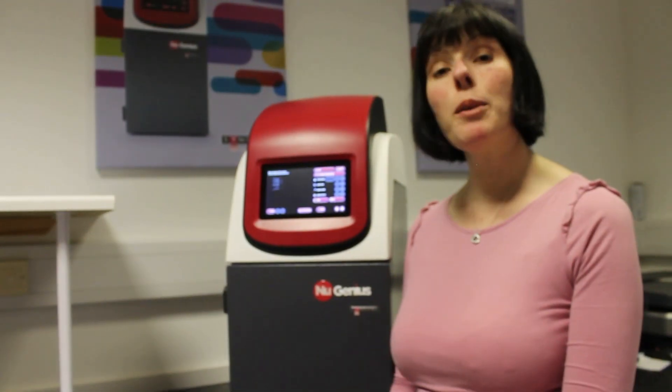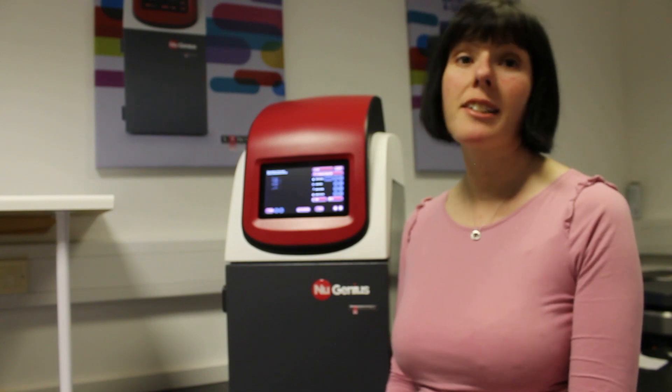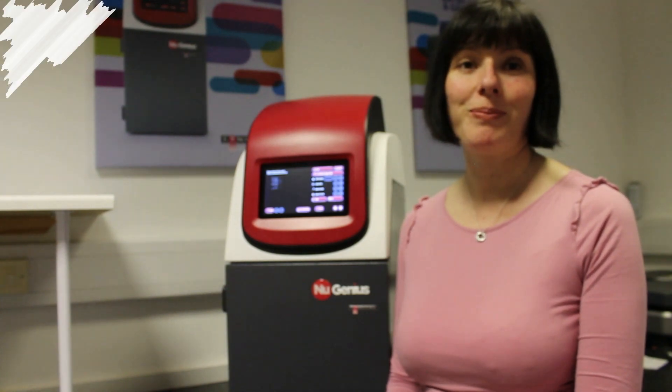We hope you've enjoyed our short video on the Neugenius system and have seen how easy it is to set up and to use.